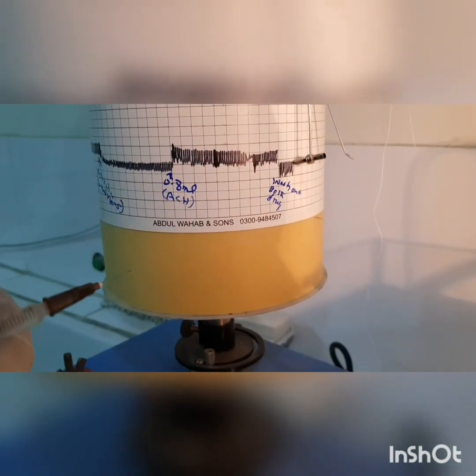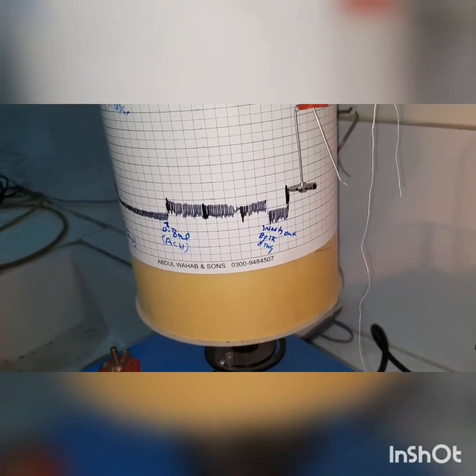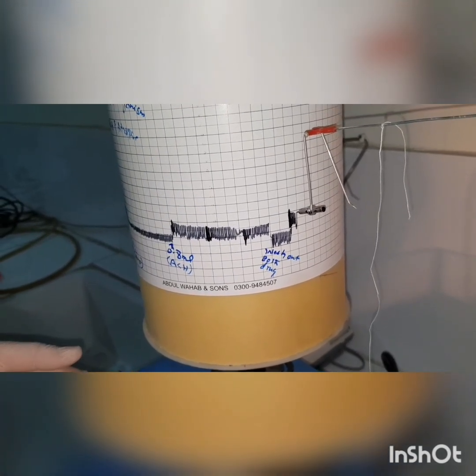Now again we are giving the agonist on the normal contraction. So the agonist again stimulates the muscarinic receptor, because there is no antagonist present here. Therefore the agonist shows more contraction.